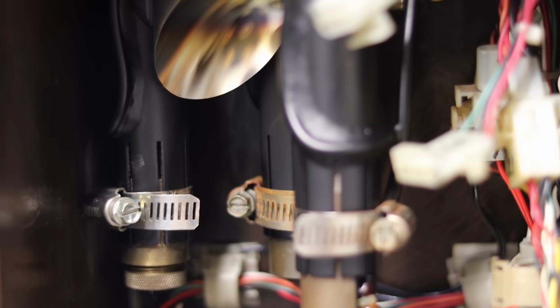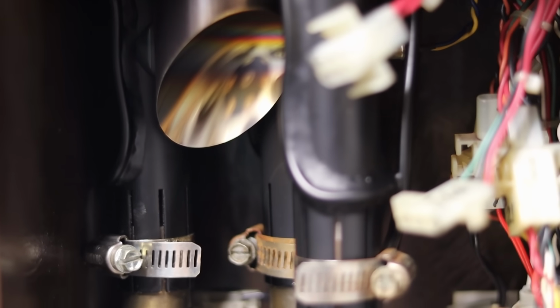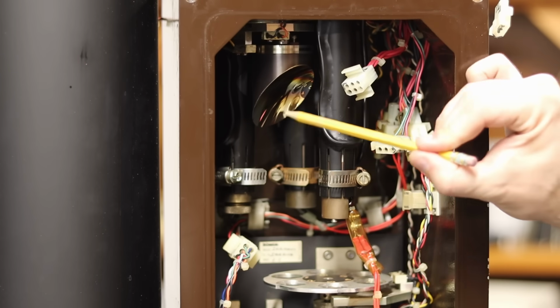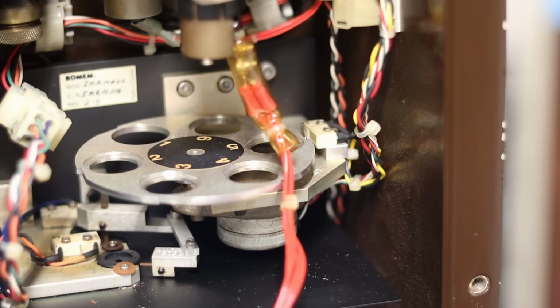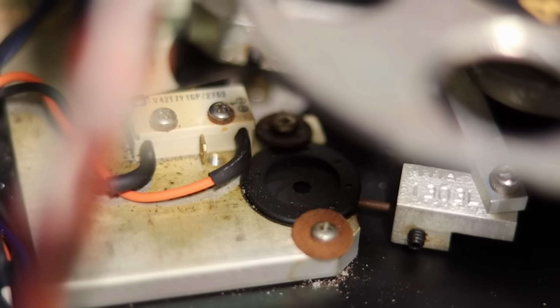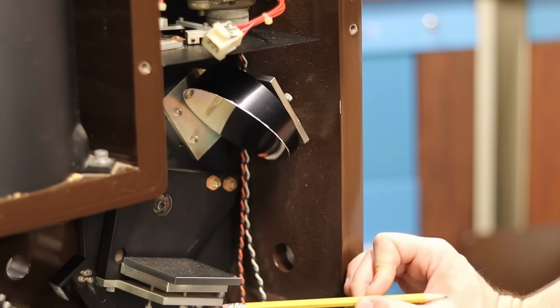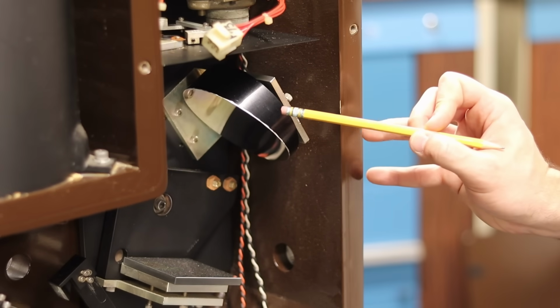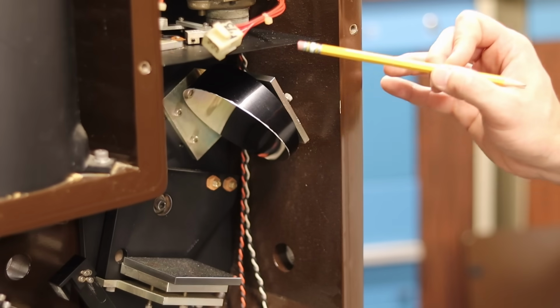So you could put a single object in there and test it through multiple different sources by just changing out the detector. Now that mirror shoots the light straight down through this little 6-shot wheel here, and you can put different attenuators in there. It goes through an adjustable iris down here and shoots straight down into a different mirror, which reflects it back up into this very specially shaped mirror here that collimates it into a beam.